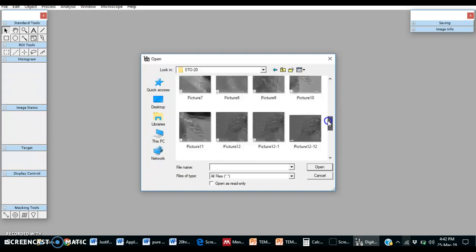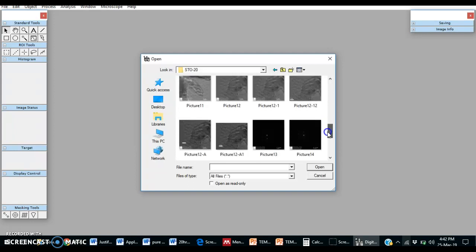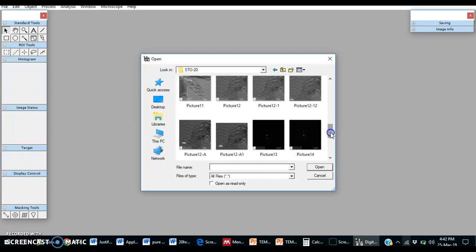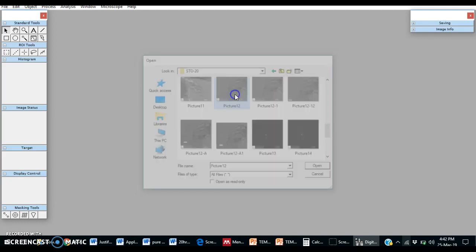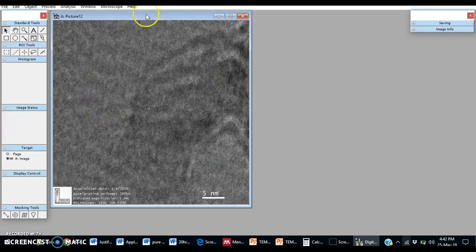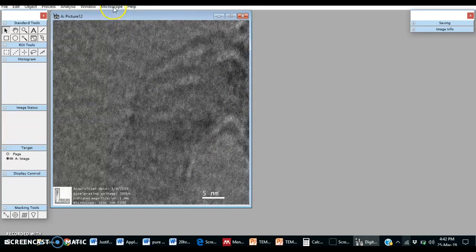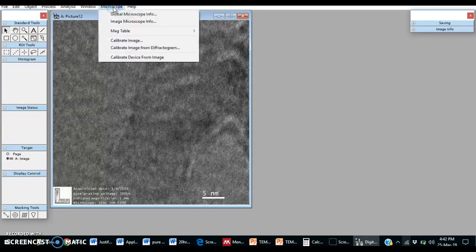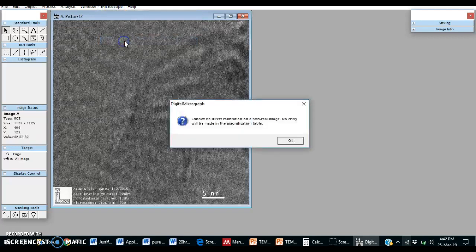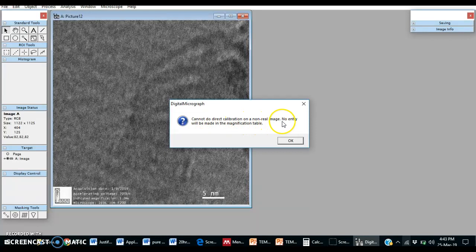We want to find out the spacing between the Bragg planes, so we choose this image. Now if we want to calibrate this image, there is a message: cannot do direct calibration on a non-real image. No entry will be made in the magnification table.